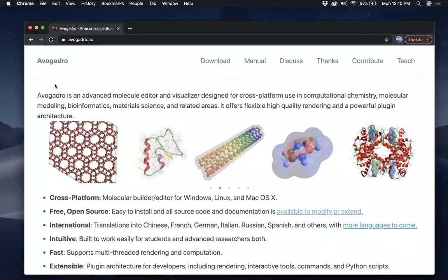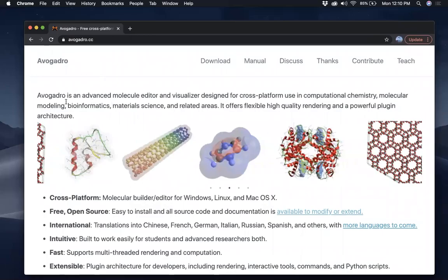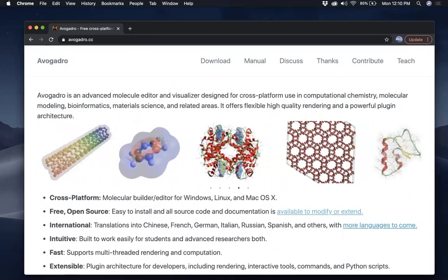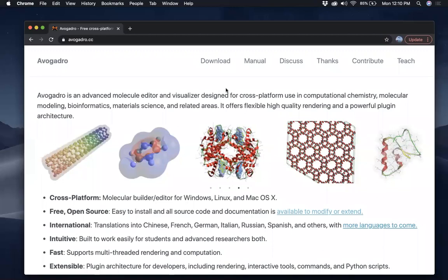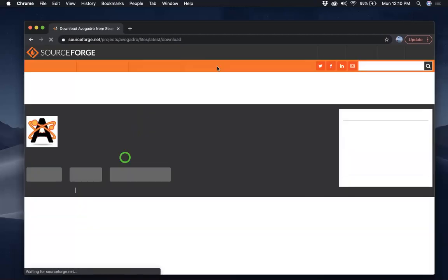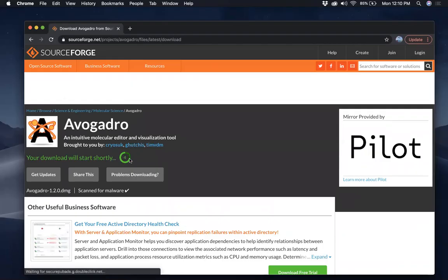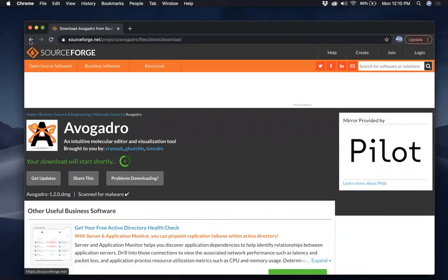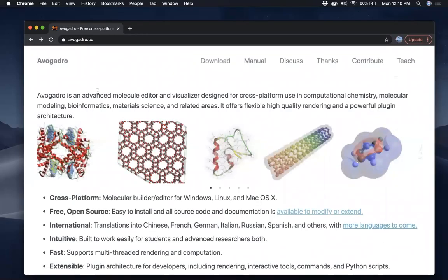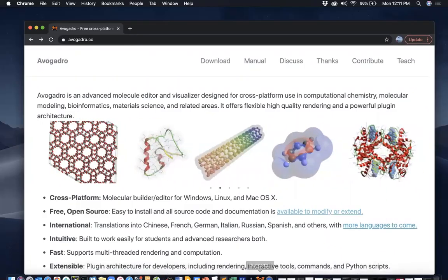Like I said, Avogadro is a molecular editor and visualizer. You can visualize molecules in all these ways as shown here. Here you can see there's the download section which, if you click on it, will direct you to this page and you'll be able to download and install the software, but I already have it installed so I'm not going to download that.